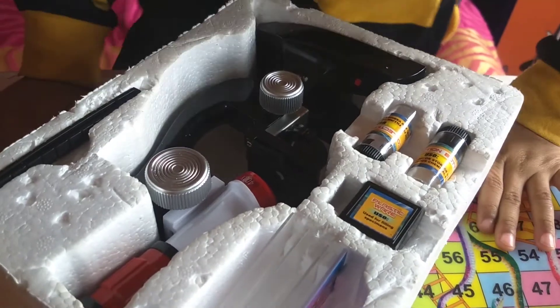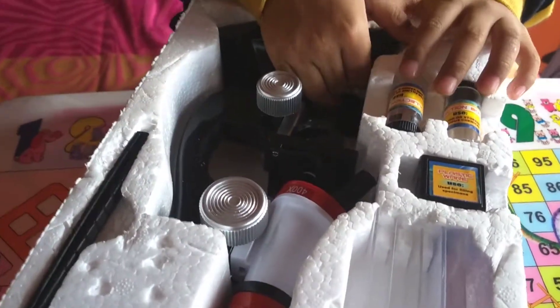Wow! Very nice packing! Let's take this out now.